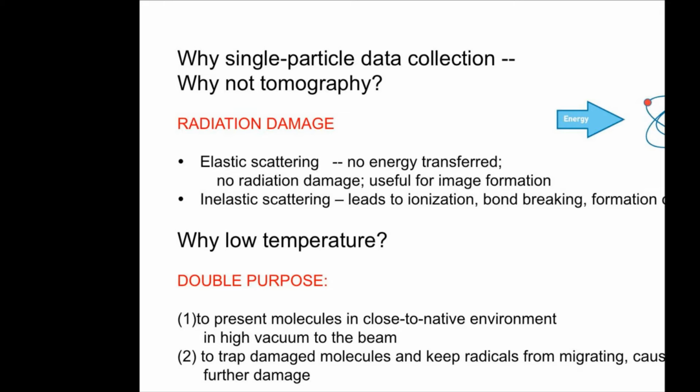So we could choose different planes here, and we will see that for certain planes we get sort of a minimum of confusion, but still we have a finite width of the image of a single point. We're going to come back to what it means to have an image of a single point.